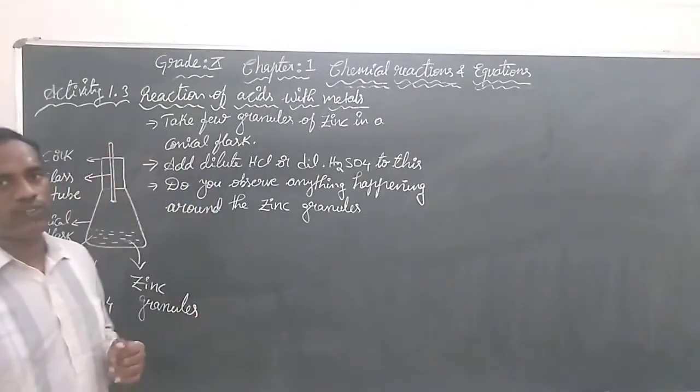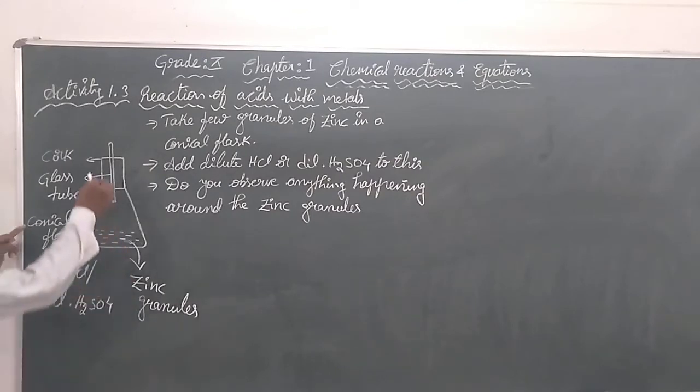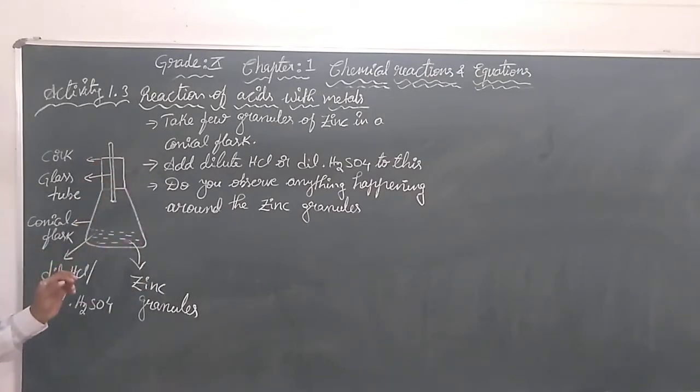In the activity, we had taken one conical flask, our laboratory equipment. Into this, we had added some dilute hydrochloric acid or dilute sulfuric acid.